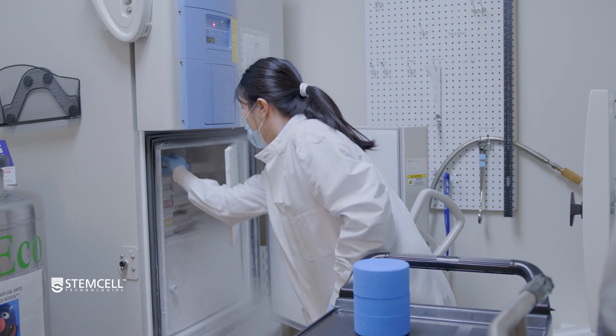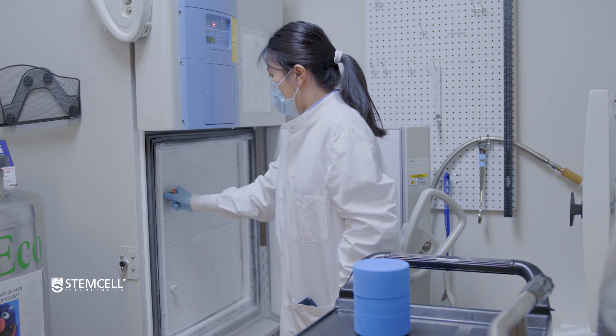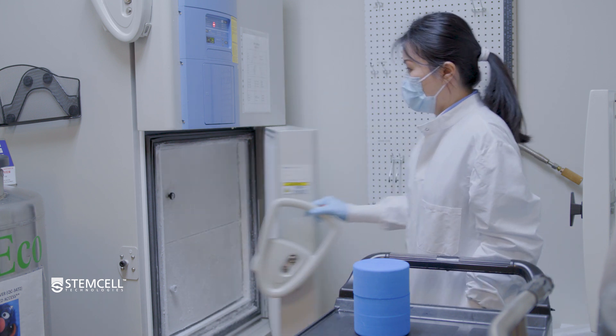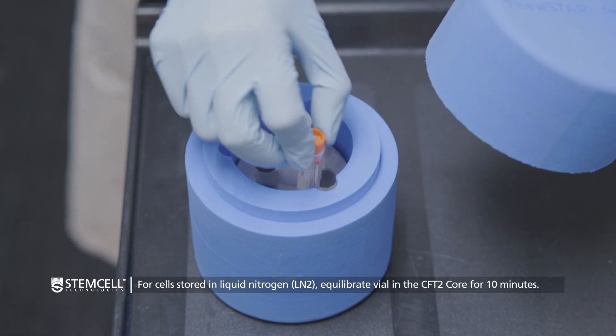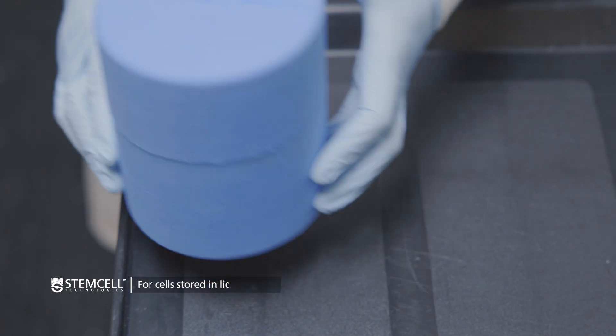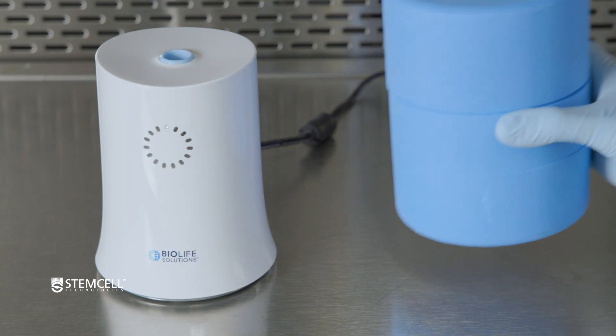Meanwhile, using your prepared Thawstar CFT2 transporter, carefully remove your frozen vial from storage and immediately place it into one of the core's 5 vial holders. Bring your frozen cryogenic vial to your thawing station.